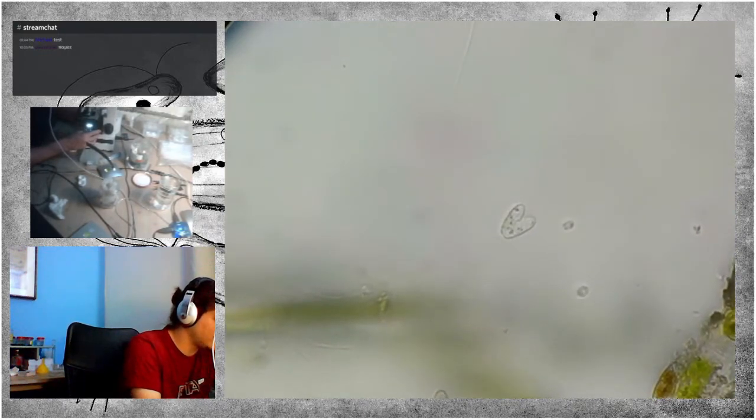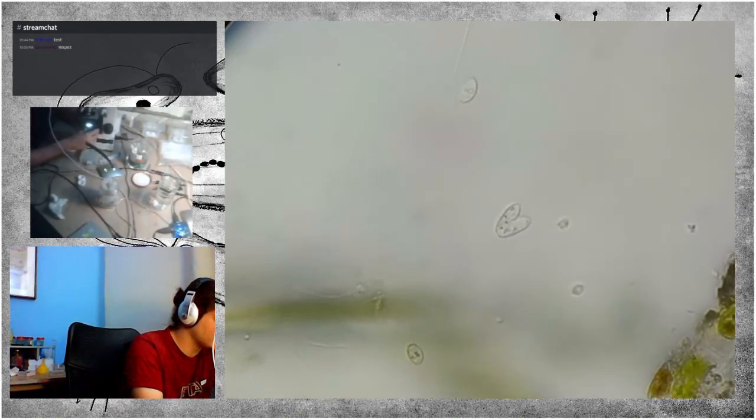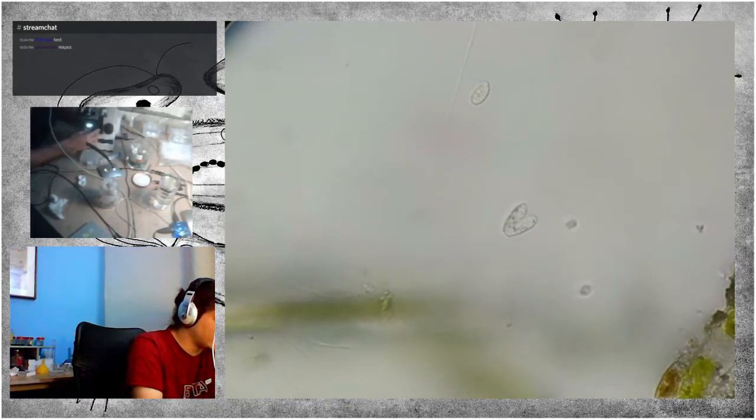In every species there are like two types, reproductive types, type 1 and type 2, and depending on which type each microbe belongs to, it can merge and begin conjugation with the other type.